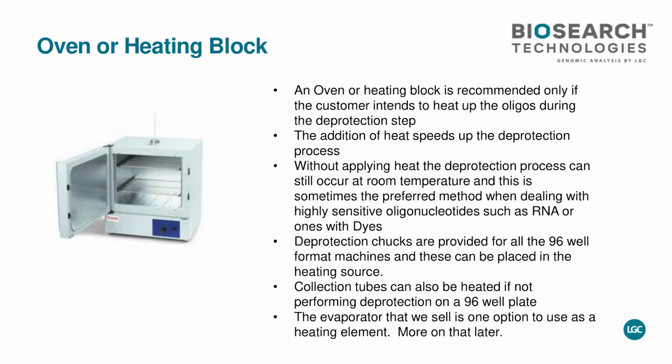To do this cleavage and deprotection, you can use an oven or a heating block. You are not obliged, because you can also work at room temperature, and you collect the oligo in the tube. The next step will be to evaporate the liquid, for instance for purification.